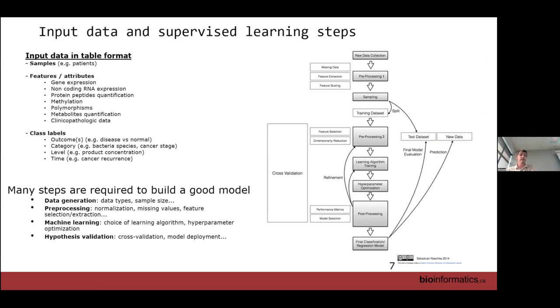And you have to follow, because machine learning is data hungry for sure, but there is an expression, garbage in, garbage out. So you really need to be focused on how you generate your data and how you feed the system. If you have noisy data and just noisy information, it will be hard to get something relevant at the end.